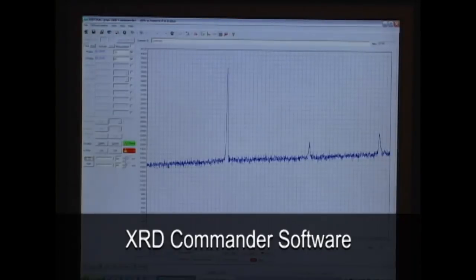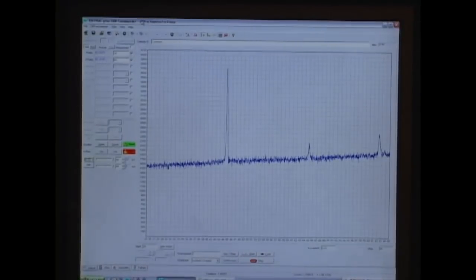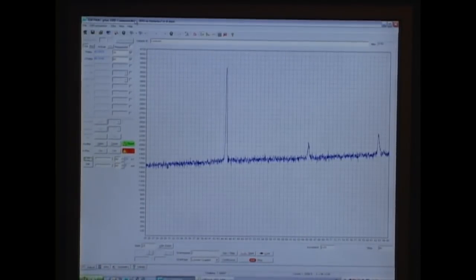So now that we've looked at the physical part of the instrument, we're now going to go to the computer. And this is where we do the controlling and where we control the ramp, where we control the power to the tube. This is XRD Commander. This application should always be on. One of the reasons is that the XRD Commander is what is controlling the X-ray diffractometer. And it's also controlling the power.